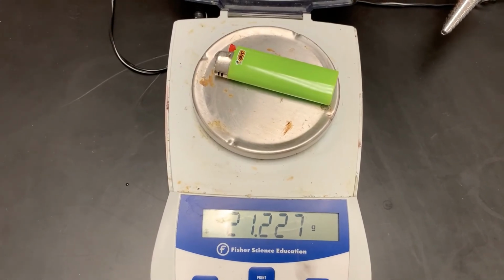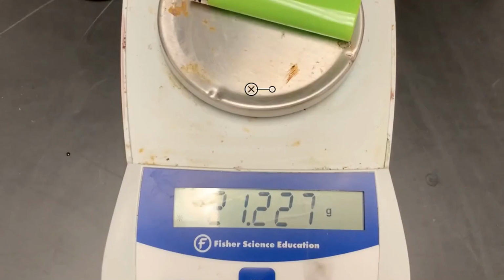So this is the new mass of the lighter. Now that you know the final mass of the lighter and the initial mass of the lighter, you can figure out the mass of butane that was released. And since you know the volume of water that was displaced, you'll know the volume of gas that was displaced. The other pieces of information that you need in order to determine the molar mass of the lighter fluid.